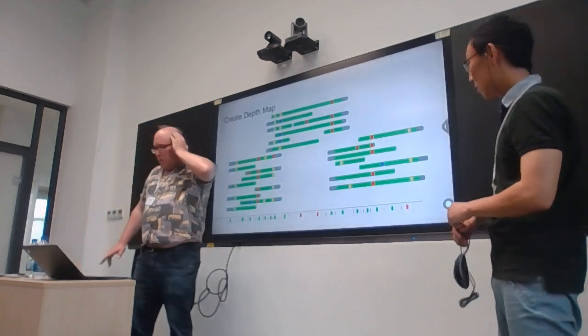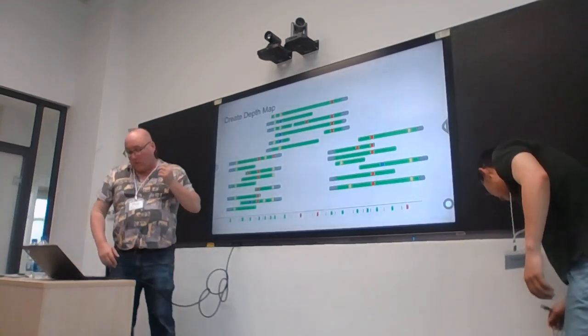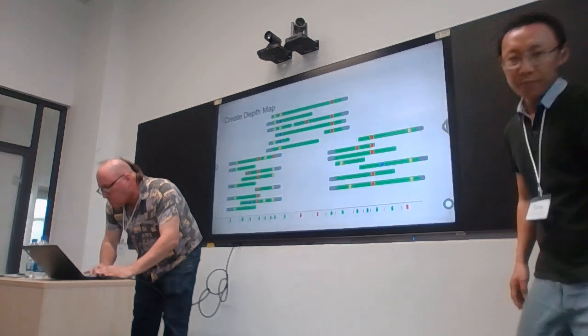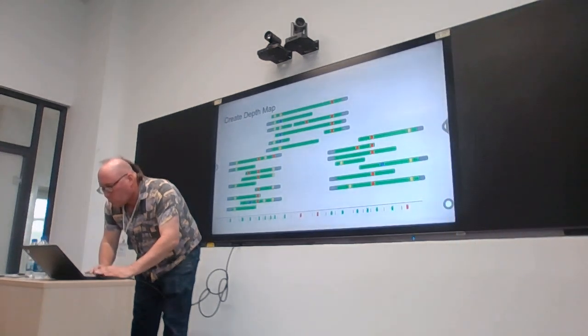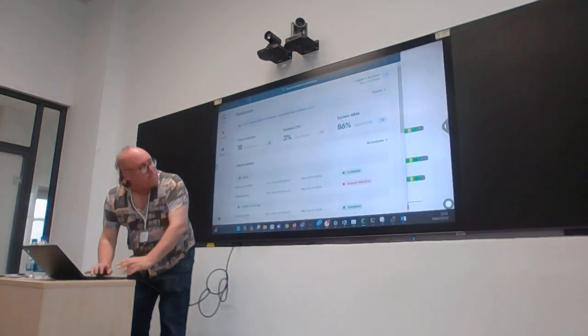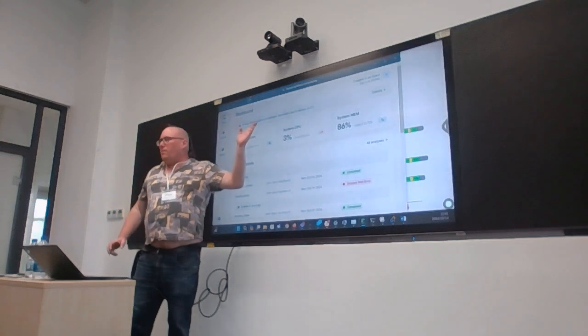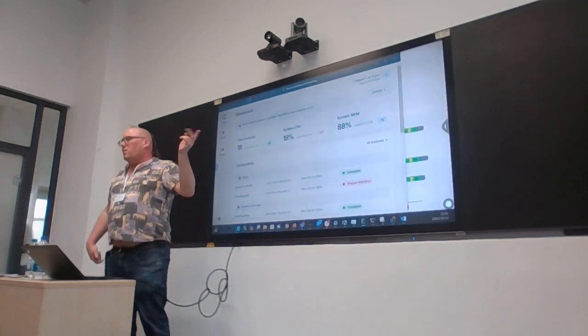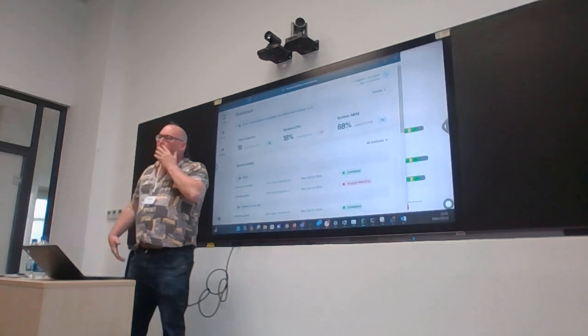Okay, I just wanted to show you something before lunchtime because we've got a lot of software to set up after lunch. So, most of you have got this screen installed, right? The Epi2Me desktop, right?